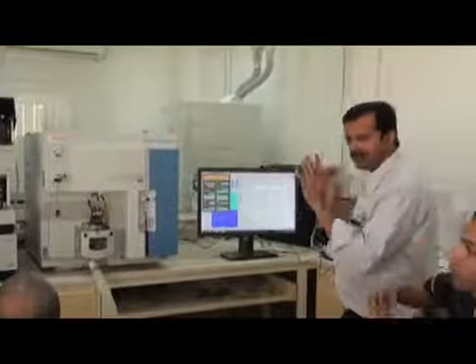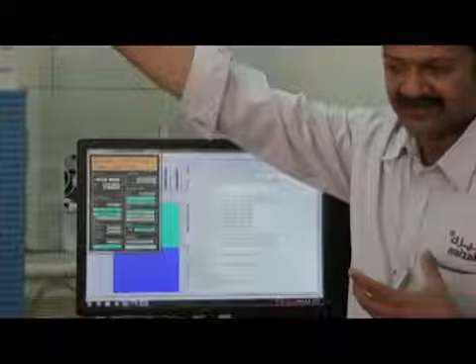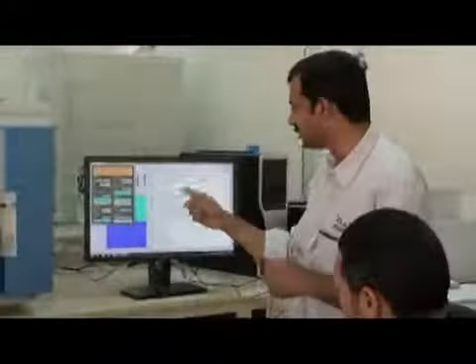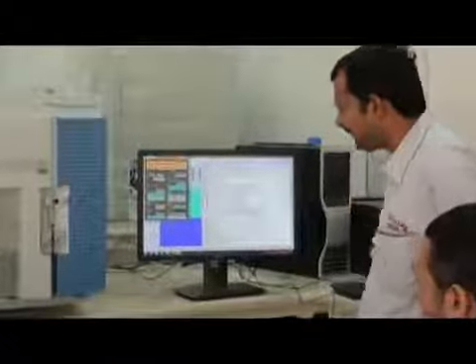Only do this. This doesn't require purging. Only do this if you forget to fill it and the line becomes empty. If you forget, it happens normally. Okay. You don't see it and it becomes empty and it gives you an error. If you do not fill it manually, it will always give you an error. Okay? So you need to do it like this. It will automatically stop. No need to worry about it. Just start it and then finish. It will automatically stop.